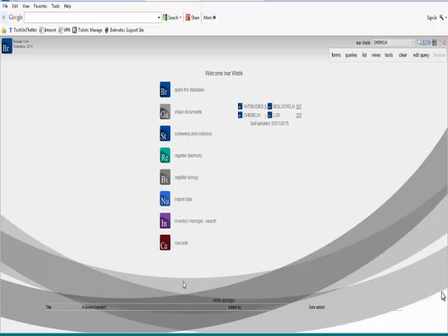It doesn't really matter. They're just collections of things that you have stored in the database. And it could be things that you've got stored in the Dotmatics database, or it could be that we've connected to one of your existing databases if these exist. And we can then look and organize that data too. So by way of example, let's go into one of these projects. You can see this user has access to 4 projects here. And I'm going to go into this ChemELN project.